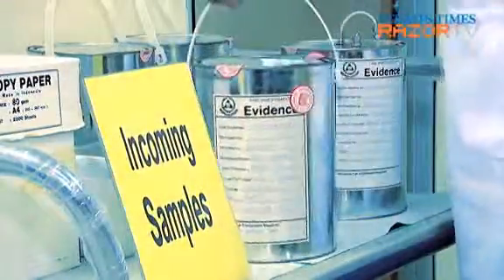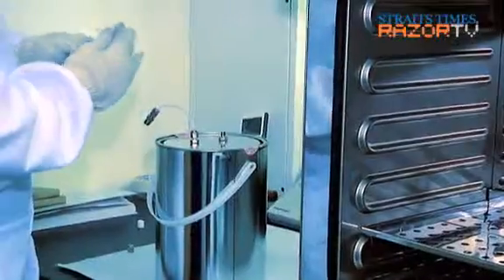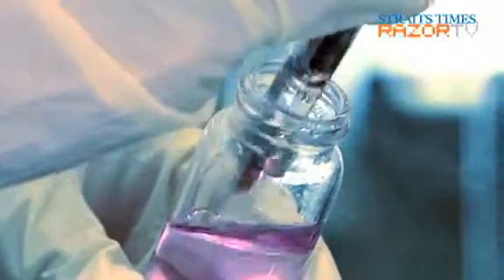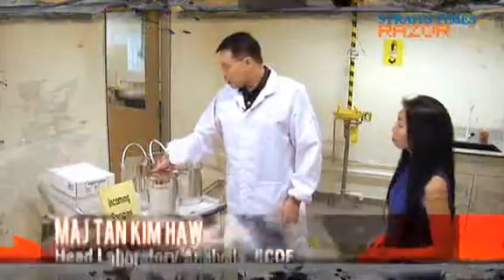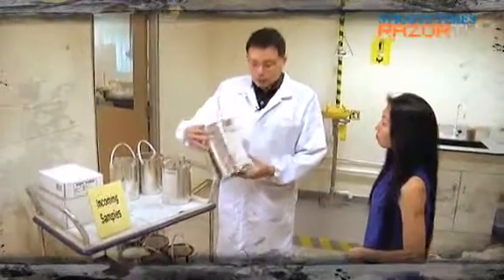When evidence from a fire scene is brought back to the lab, the work begins for these fire research analysts. Their job is to examine the type of materials or substances found in the fire debris to help determine the cause of the incident. Usually we will collect the fire debris in this type of tin. This is the evidence tin. All the evidence label documentation is actually based on the tin. So based on this evidence, we roughly know which case it belongs to.